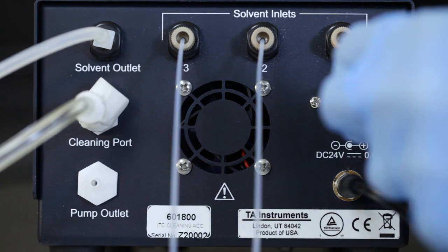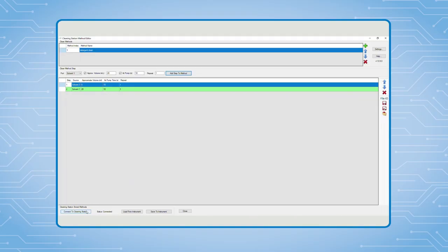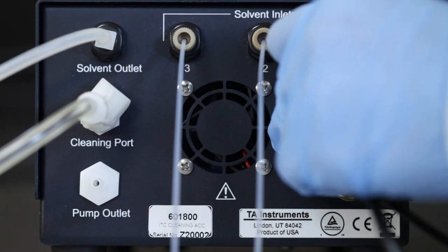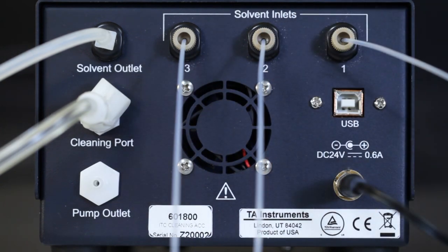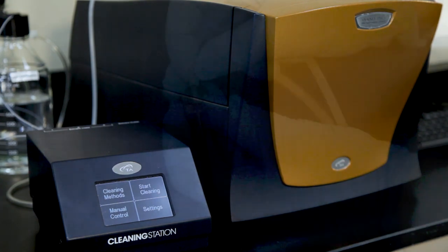After the cleaning method or methods are written, they are transferred to the device via a USB cable. After attaching the cable, the cleaning station can be detected by the software. The files are saved and ready for transfer. To transfer the files, the user will select Save to Instrument. After the update, an audible beep will sound and the USB cable can be detached and the cleaning station can be moved around the lab for use on multiple instruments.